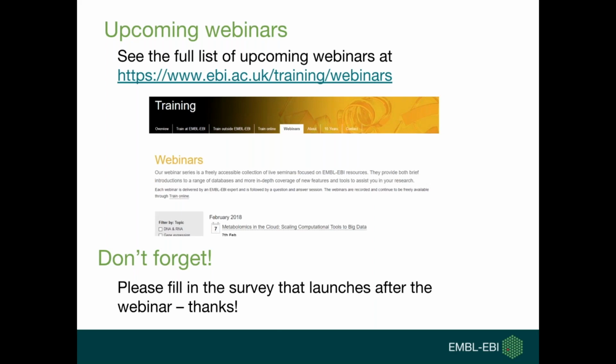And our next step now is to actually link this to specific entry pages where you will get all this information. So we have, in most of the cases of these resources, they provide a raw score that they calculated, a confidence score that they calculate, and also a classification of the confidence, which is basically low, medium to high. The reason being that the number they use for confidence score can be very different between different resources. But yes, that data will be certainly available.